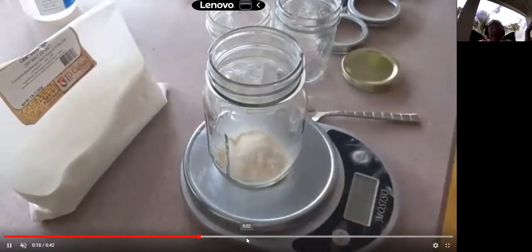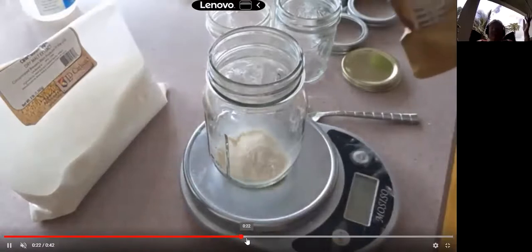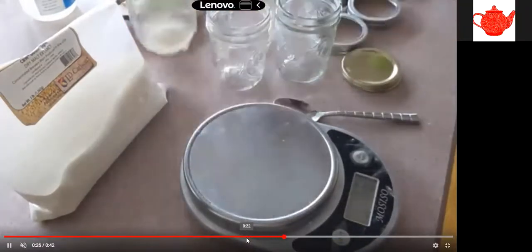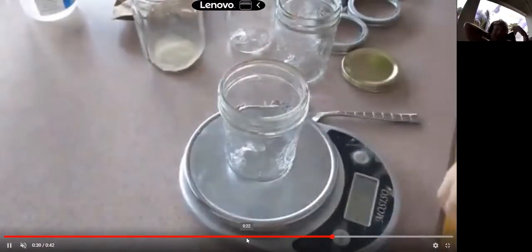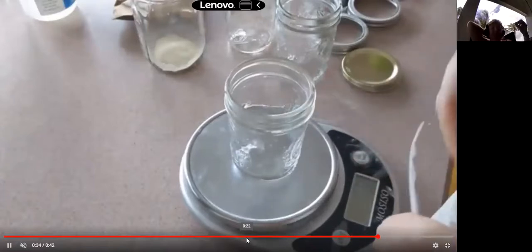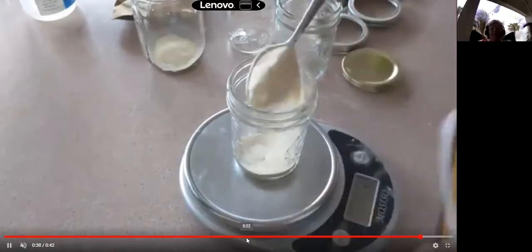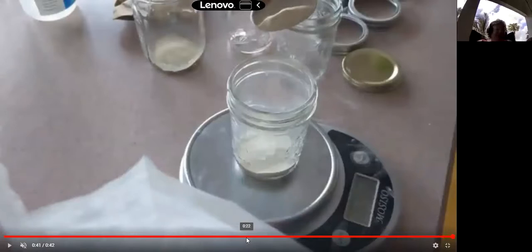You put your powder into your very special canning jar, just a regular canning jar. You add water, and that's it. That's all you have to do to make agar, solid media, or liquid media. The thing to remember here is at this point, nothing is sterile, right? Just using a regular spoon, non-sterilized containers, we're just weighing out our ingredients.